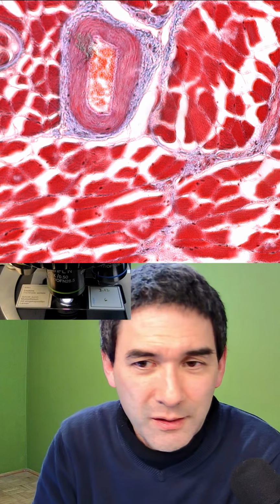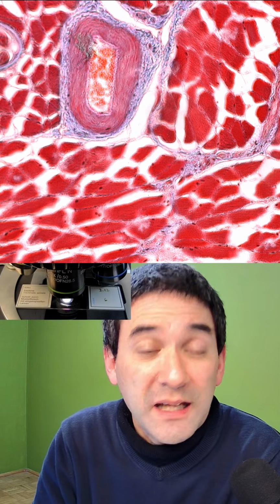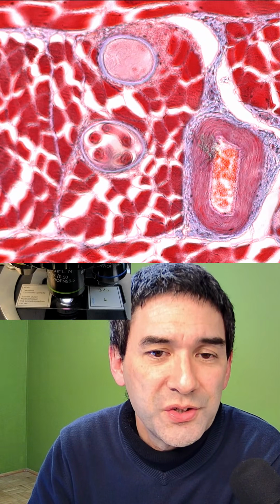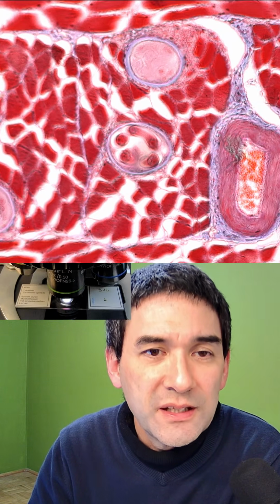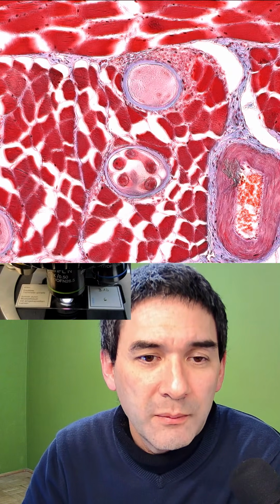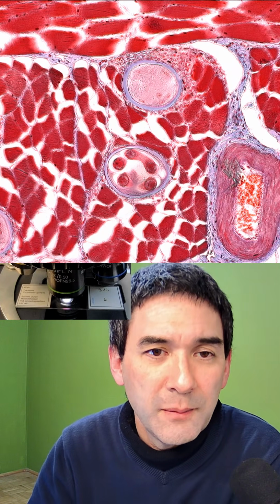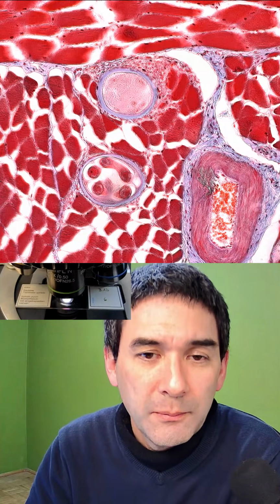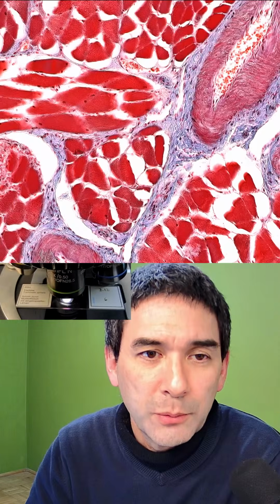It's pretty scary. Oh, here are 2 other cysts in the center. That's actually one of the reasons why raw pork is a problem, or can be a problem, if not properly monitored.